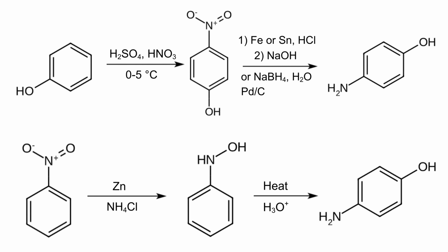I'm going to extract the paracetamol using the exact same method I mentioned in a previous video, and then I'm going to hydrolyze it using hydrochloric acid and microwaves. For this experiment, you will need hydrochloric acid, a lot of paracetamol, distilled water, sodium bicarbonate, and methanol.